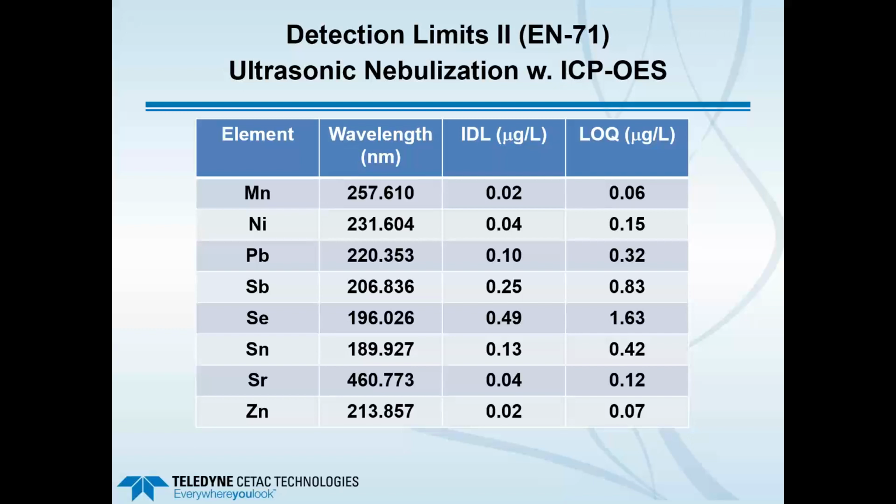And again, this is using ICP, optical emission, and no internal standard, and certainly not under clean room conditions, but using as clean reagent vessels as we could have with pre-cleaning them, and higher quality reagents such as an Optima grade or double distilled grade of HCl.